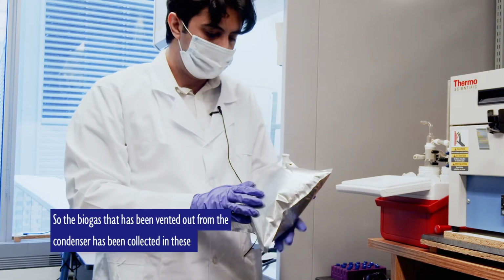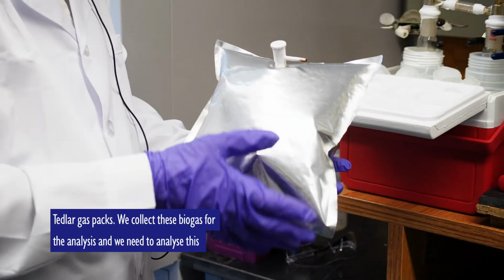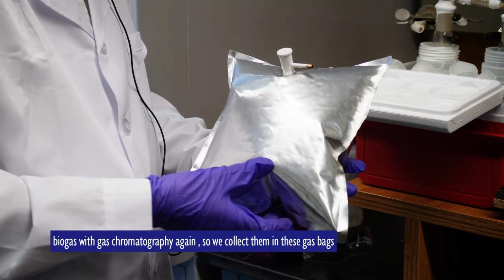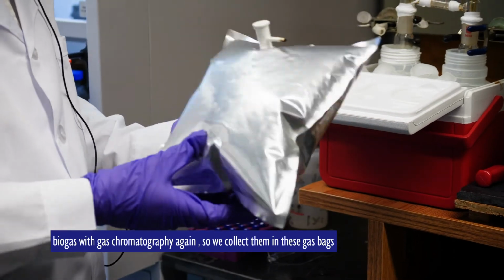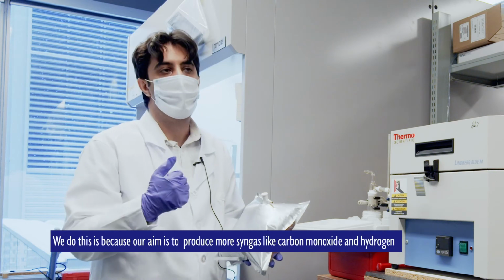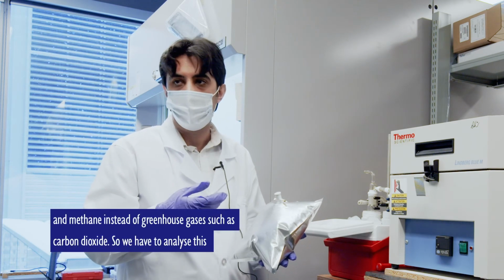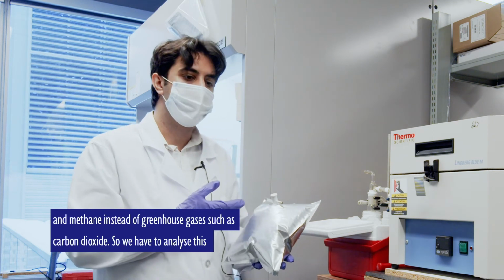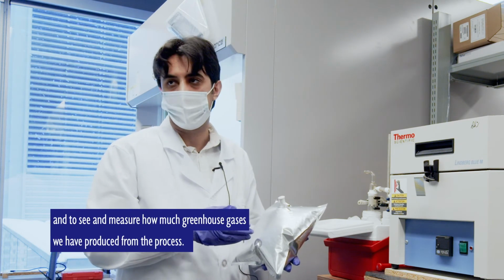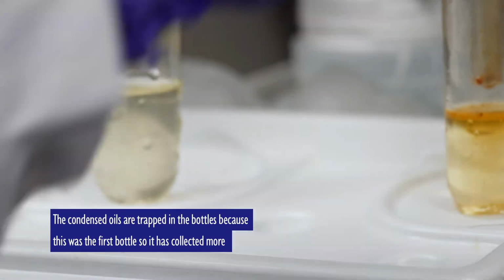So the biogas that has been vented out from the condenser has been collected in these Tedlar gas bags. We collect this biogas for the analysis, and we need to analyze this biogas with gas chromatography again. The reason we do that is because our aim is to produce more syngas like carbon monoxide, hydrogen, and methane instead of greenhouse gases such as carbon dioxide. So we have to analyze this and measure how much greenhouse gas we have produced from the process. And the condensed oils are trapped in the bottles.